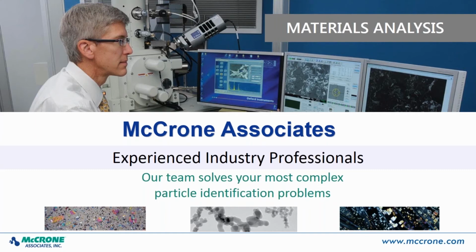Whereas with dispersion staining, you don't choose those colors. The colors you get there are inherent to the sample and can be used diagnostically. So those colors will actually give you information about the refractive index of your sample, and you don't choose those colors. So in that sense, they're very different.